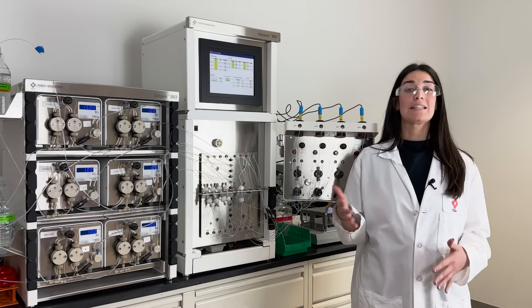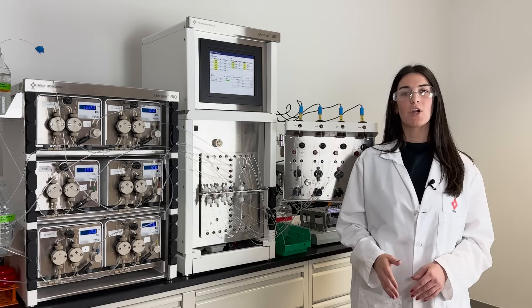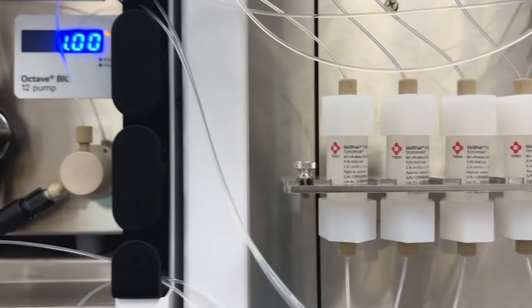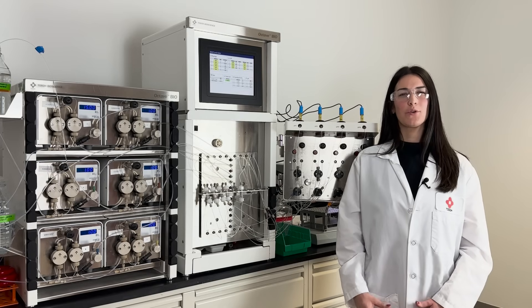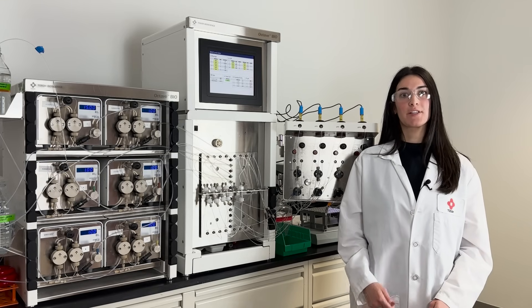The thing that these techniques and applications all have in common is that your separation steps are occurring simultaneously on multiple columns. As you can see here, we have five columns set up for this particular separation. This is different from traditional batch chromatography where you're only utilizing one column and your separation steps are occurring sequentially.